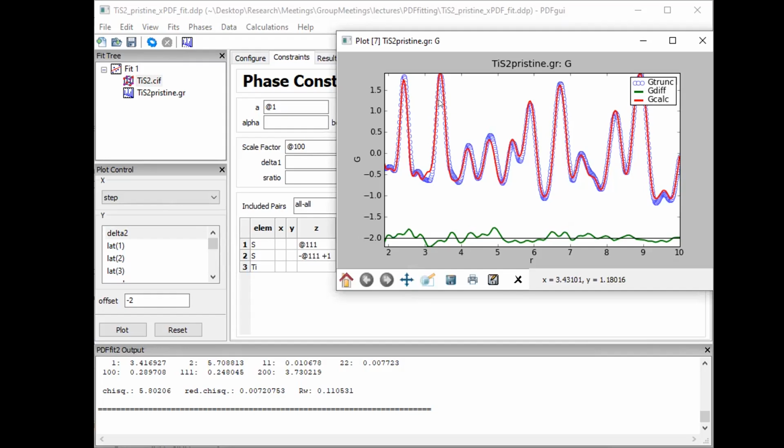Then we can check. We have some very easy ways to check. My first guess would be, okay, this looks like maybe titanium, right? Since in the sulfide or oxide, the first peak is transition metal to oxygen or sulfur, and the second one is transition metal to transition metal. That's my first thought.